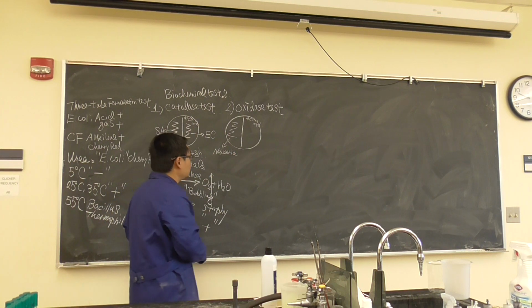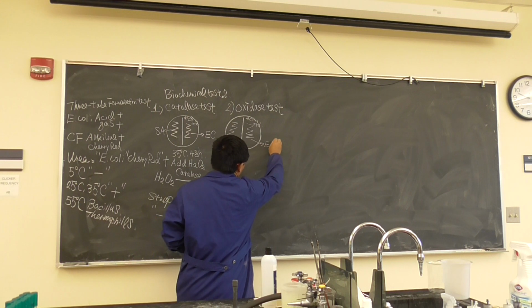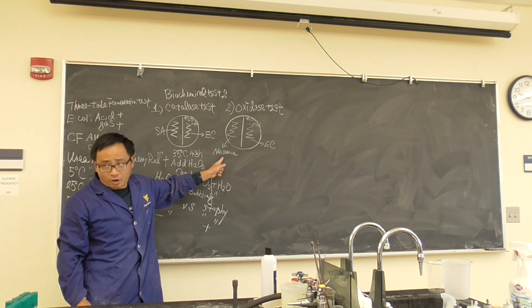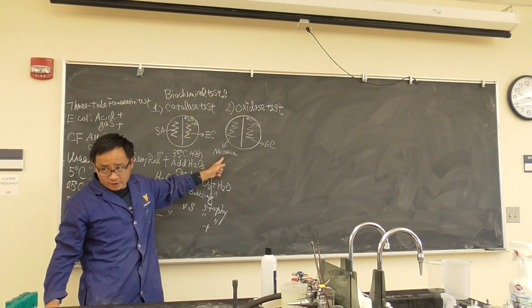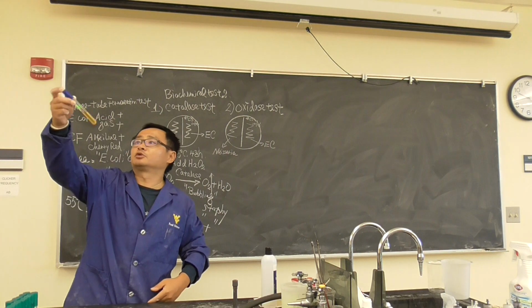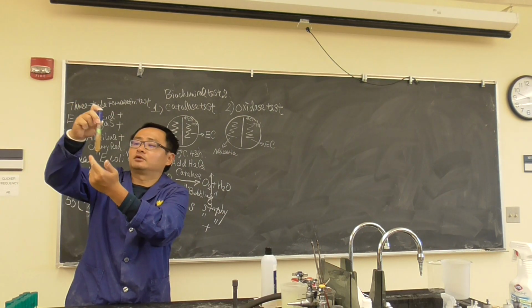On the right side, we will inoculate E. coli. Okay, remember, we talked about Neisseria meningitidis and Neisseria gonorrhoeae, a typical colony, oxidase test positive, and fastidious bacteria. We'll see whether it grows. It should grow, maybe not. Looks like in a blood media, it grows okay. You see some sediment at that, but you have to shake it really well, okay?